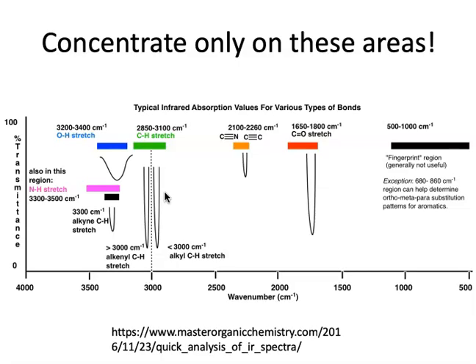And we'll just go through a couple of things, right? This C double bond O stretch turns out to be incredibly diagnostic. So if I were teaching this in class, I'd say look at 1700 thereabouts, and look for a really nice intense peak, which you'll see some examples of in just a second. Another thing which is really important to look at is this region from let's say 2000 to 2600 or so, which usually is flat as a pancake. If there's a triple bond in there of either of these two types, usually there'll be some little tiny peak there.